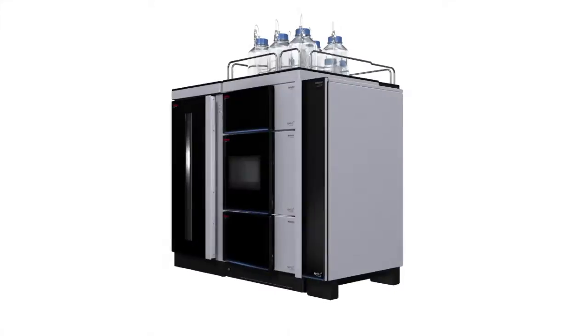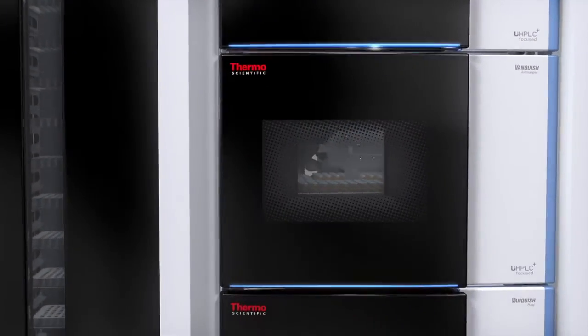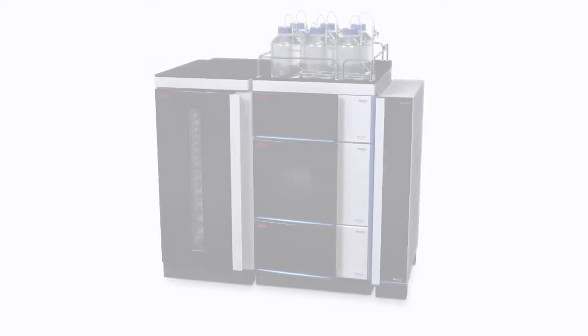we embraced UHPLC as the standard for all our liquid chromatography systems. Now we offer the Thermo Scientific Vanquish UHPLC system, combining all our knowledge and passion for chromatography into one revolutionary instrument.